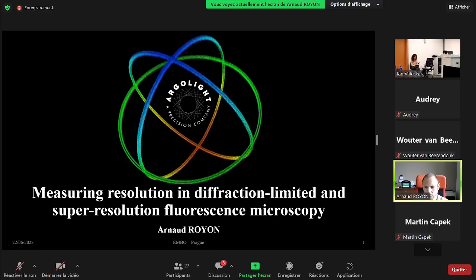Thank you for this nice introduction. So I work at Argolight. For those who do not know us, we are a French company located close to Bordeaux in the southwest of France. And we basically design, manufacture, and commercialize tools, both hardware and software, for the quality control and the quality assessment of fluorescence imaging systems. And today I would like to talk to you about how to measure resolution in diffraction limited and super resolution fluorescence microscopes.